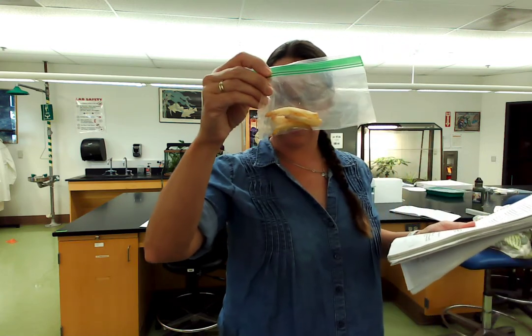one of the things that we're going to be running these biomolecules tests on is a regular food sample, a type of food I brought in. Just so you know, our food sample is going to be French fries that I brought from home. I have a whole container full of samples to run and a bunch of reagents to run approximately 5 different tests on.